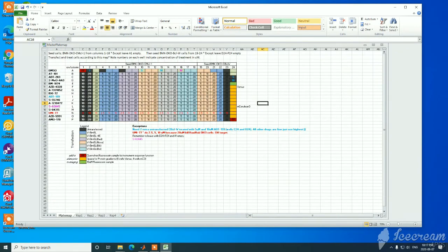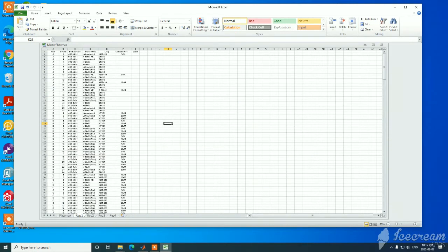So don't include the wells with your IRF or your Venus or cerulean 3 protein gradients or any empty wells. Just exclude them from creating this plate map. So that's pretty much the only rules, except for you need to indicate.